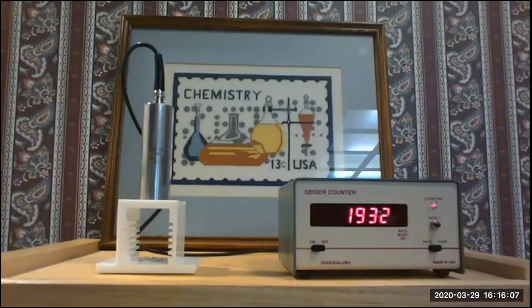So after 1 minute, it decreases to 1932. So we're definitely not down to half of 2522 yet. Half of 2522 is a little over 1200. At 2 minutes, we have 1460. We're still not down to half of what we started with.